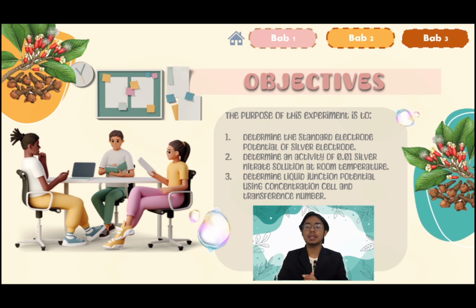The purpose of this experiment is threefold. First, to determine the standard electrode potential of a silver electrode. Second, to calculate the activity of a 0.01 molar silver nitrate solution at room temperature. Lastly, third, to evaluate the liquid junction potential using a concentration cell and the transference number. This investigation provides a deeper understanding of electrochemical behavior and solution properties.